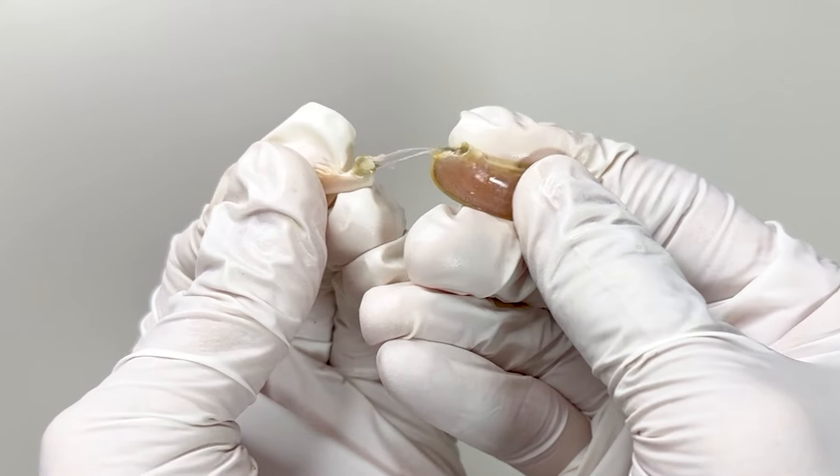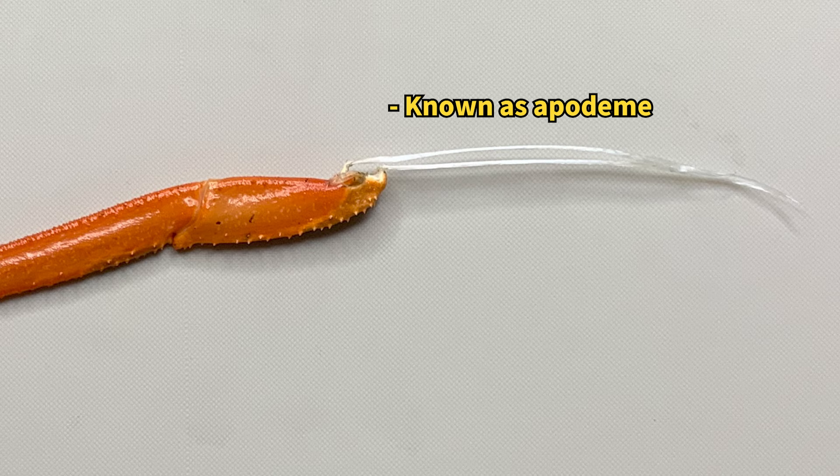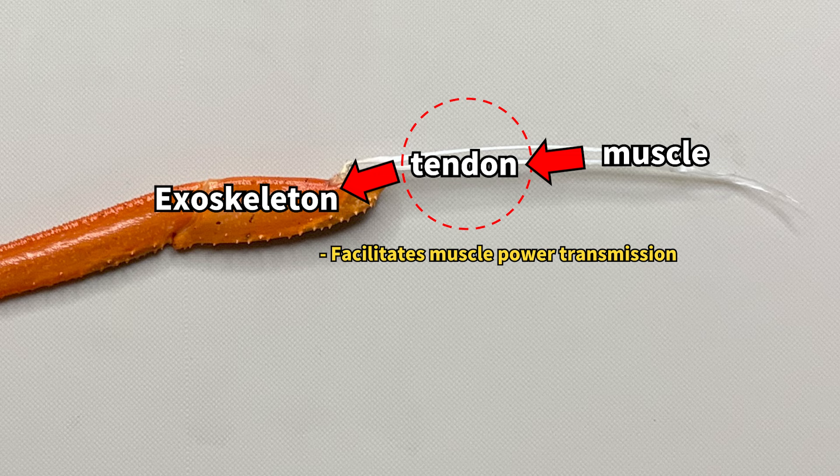Pulling out the legs reveals a structure resembling the plastic strand when eating crabs. This is a tendon-like tissue that connects the internal muscles to the outer shell, and is crucial for the mantis shrimp's movement.